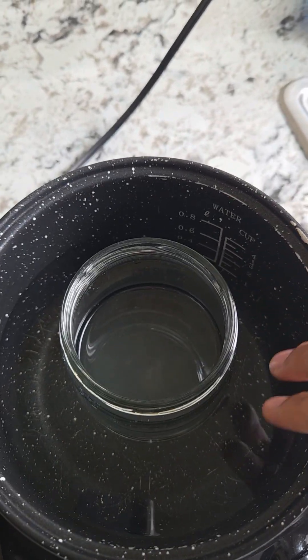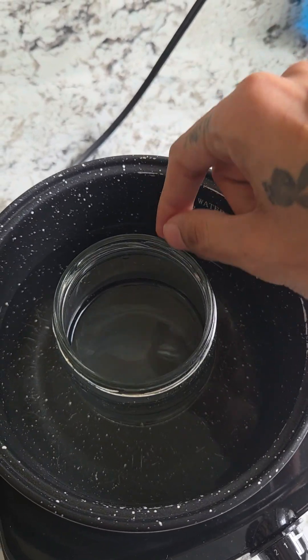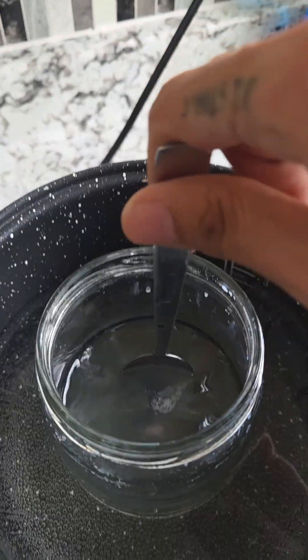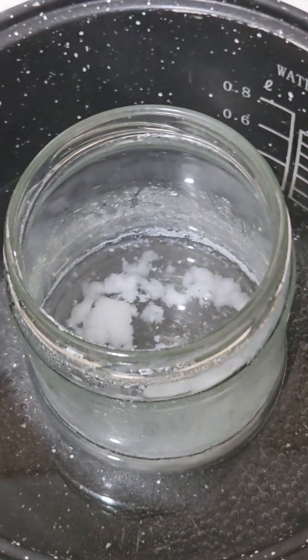That's all the leftover waste. Double boiler method pretty much — we're heating up the water here, which is hot as fuck, and using that to encourage dehydration inside this jar. 15 minutes in, another 15 minutes... about an hour and 15 minutes in. This is like five hours later.